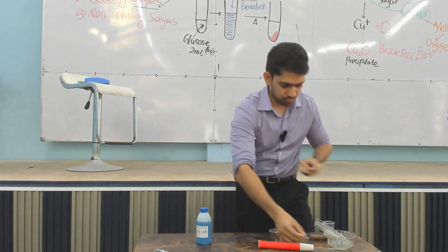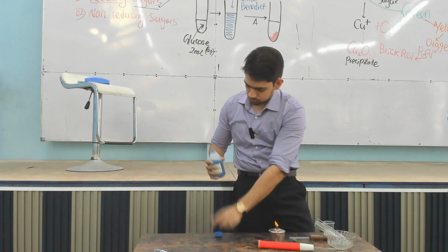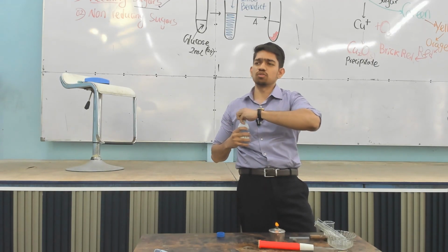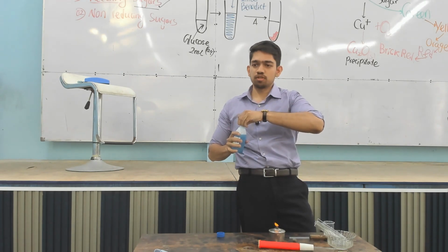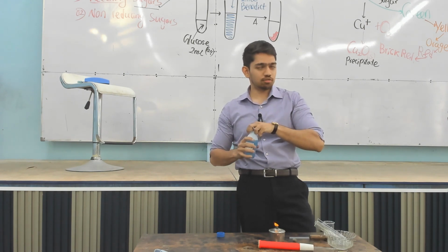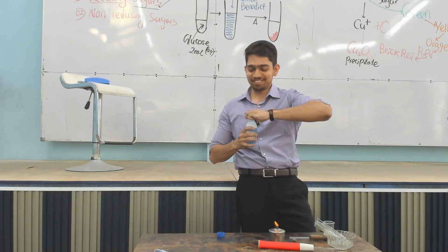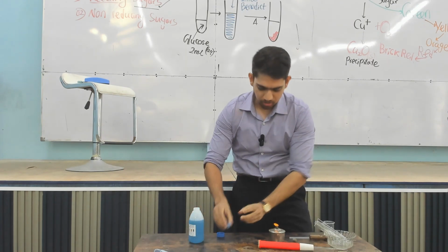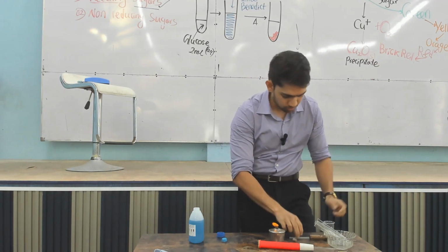Fire alarms, right? Okay. So these Benedict solutions, as you know, are aqueous solutions, and if they have been exposed to the atmosphere for some time, the amount of ions they have can reduce. Very unlikely that we'll get a precipitate, but there will be a color change, right? We'll see if there is a color change.